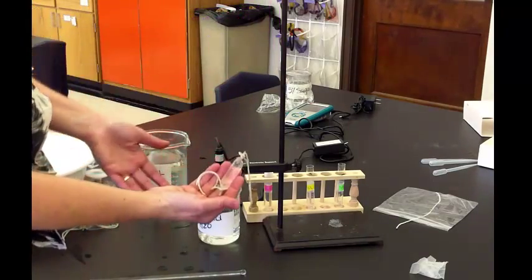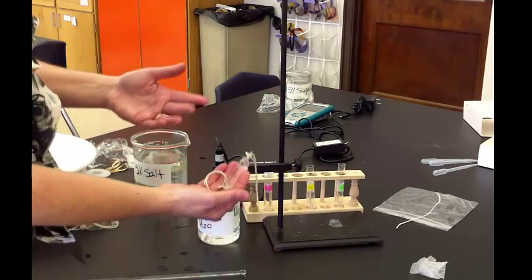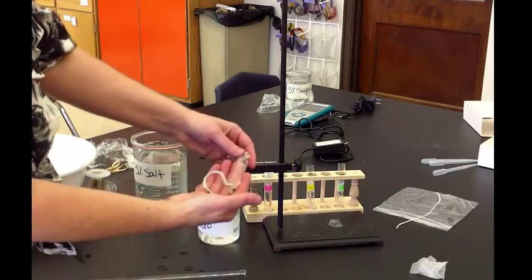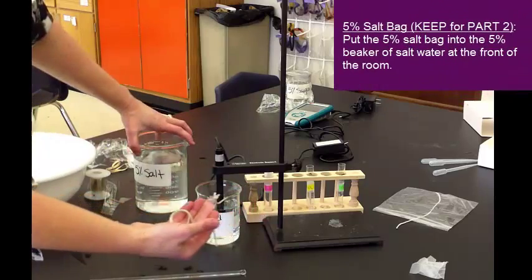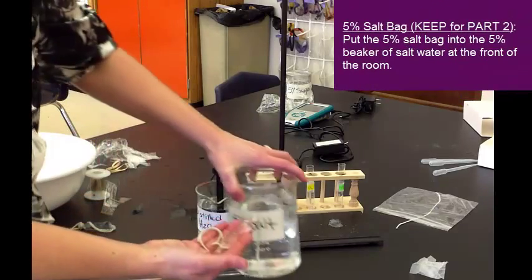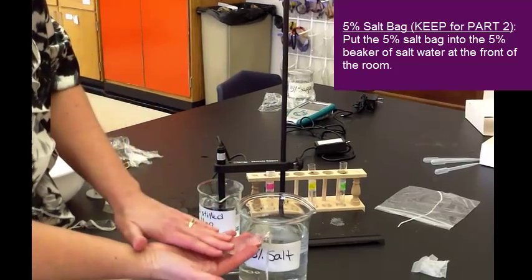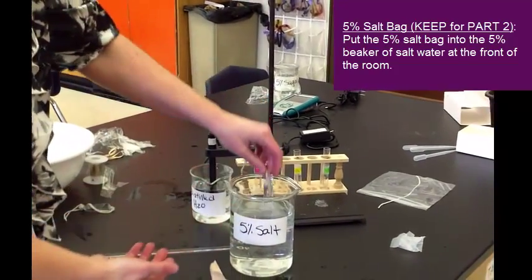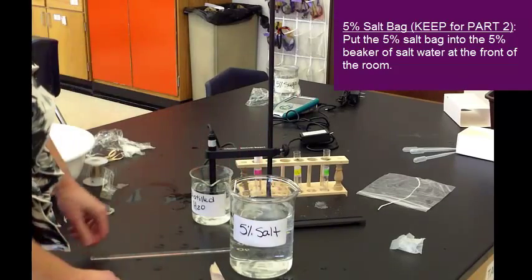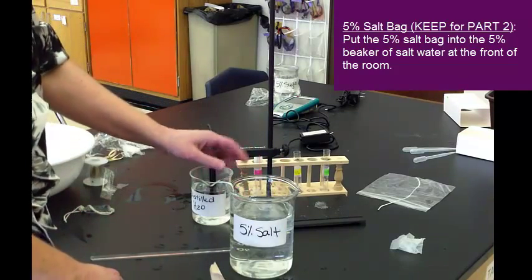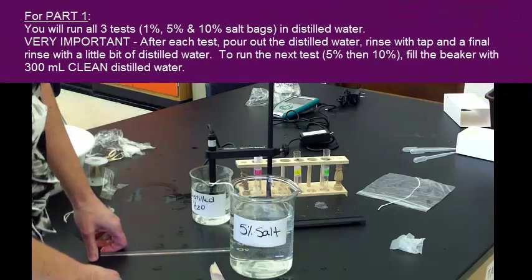Now, the 1% bag you'll throw away, unless you want to keep it. The 10% bag we don't need. The 5% bag you are going to need for part 2. So, I will have a beaker that has 5% salt, which you put in the bag. So, I'm just going to put it back and let it float, and when I'm ready for part 2, I'll come up and grab one.